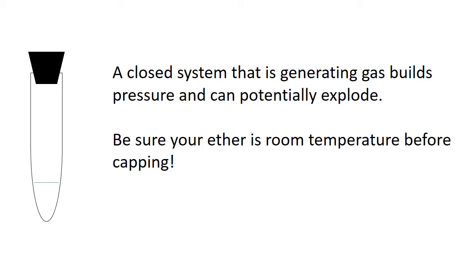The procedure says that you need to be very careful about making sure the test tube is at room temperature before capping it, and that is because ether vaporizes at a very low temperature, and producing gas in a closed system is dangerous. Best case scenario, the stopper will pop off. Worst case scenario, the test tube glass cracks and explodes, and we definitely don't want that, so be sure that your test tube is completely cool.